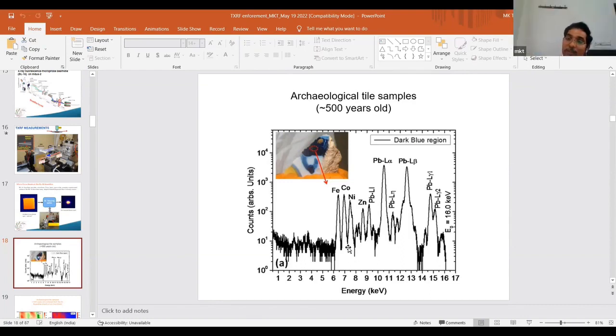Yeah, we must solve this. This is what is important. Yeah, sure. This is what we highlighted. You have rightly pointed out. Spectrum fitting is the main problem during quantitative analysis. If you rightly fit the spectra, correctly analyze the spectrum, and correctly determine the intensity of different peaks, then you can definitely determine the concentration very precisely.